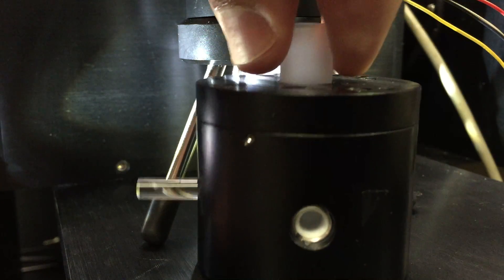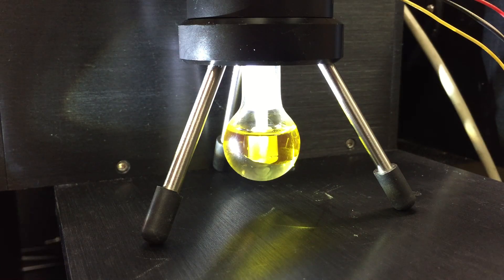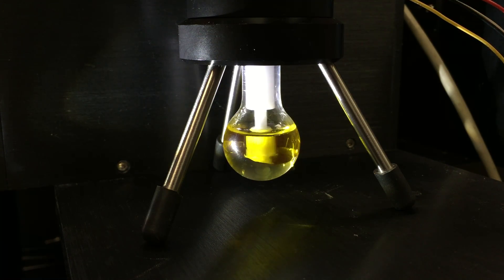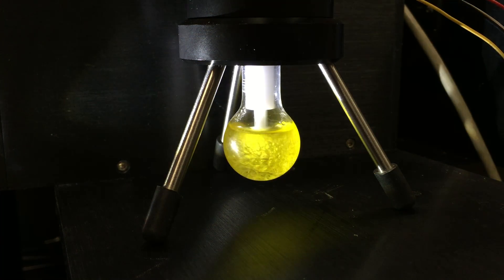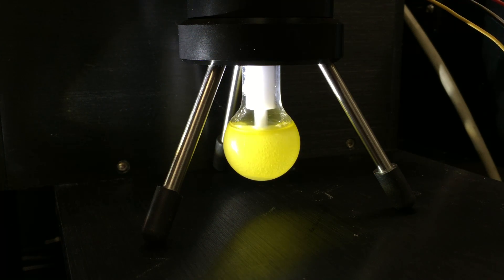This is our DSPC chamber and this is what's going on inside DSPC upon stirring oil and water. We are increasing the motor speed slowly and you see the emulsification — the phase boundary is separated, sorry, it disappears.